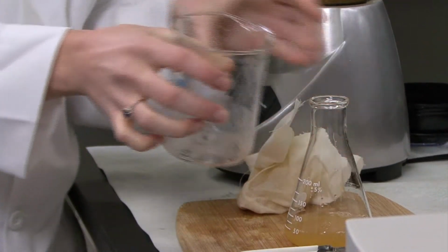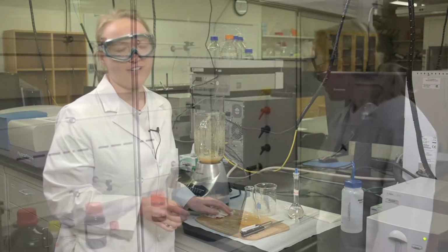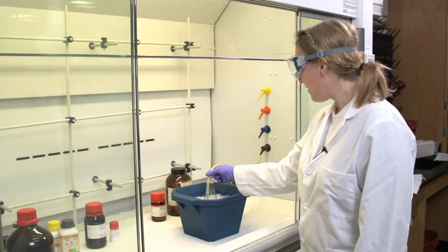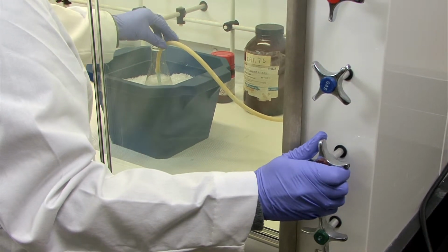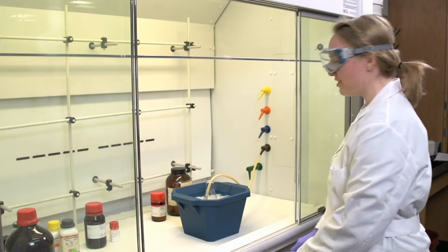Take it over to the hood where you will keep it on ice and bubble nitrogen through it to reduce exposure to oxygen. You can put the pipette tip that's connected to the nitrogen line in the apple catecholase solution and then turn the nitrogen gas on to bubble nitrogen through the solution. This will reduce the exposure to molecular oxygen and prevent our solution from browning.